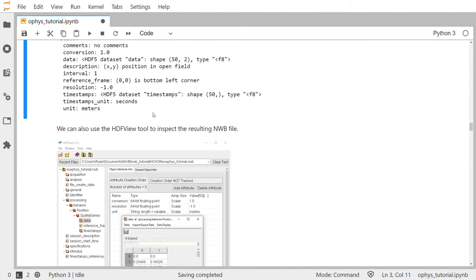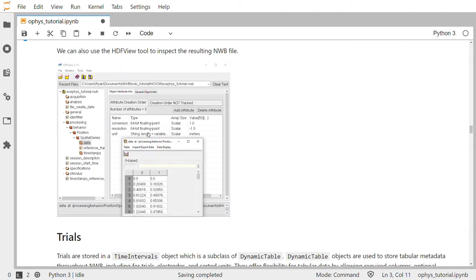We can also use the HDFView tool to inspect the resulting NWB file. HDFView is the common utility program supplied by the HDF5 group, and you can see how the NWB file is structured internally. It has a bunch of groups and datasets, and our spatial series is stored in the processing group, which has a processing module called behavior, an object called position, and within that the spatial series object.